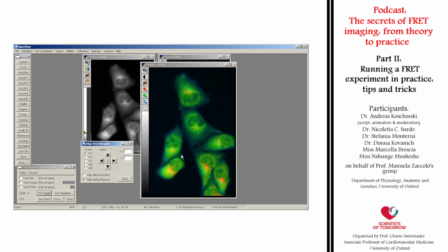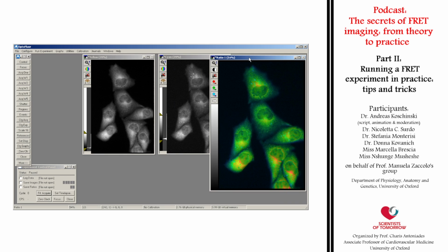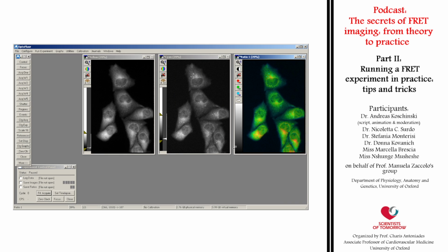In my setup, I try to keep the central area best possibly aligned. In case I have to analyze also other parts of the image, I can just apply the adequate software alignment during offline analysis and run a second analysis. If you would like to software align your images already at acquisition, you may now tick Align after acquisition, which then applies the alignment to all further acquisitions. However, I tend to rather accept small misalignments during acquisition than to store already processed data. Anyway, the final analysis will be done offline. Therefore, I usually untick this option and do it only during playback.